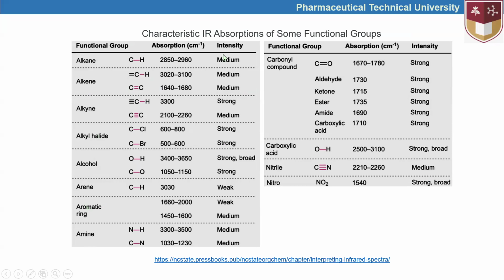They can be qualified as medium, strong, or weak in some cases in aromatic compounds. These are some other pointers that we have to take into consideration.